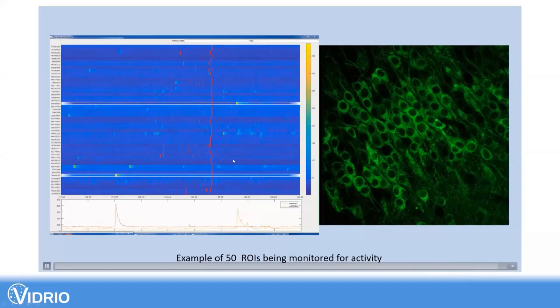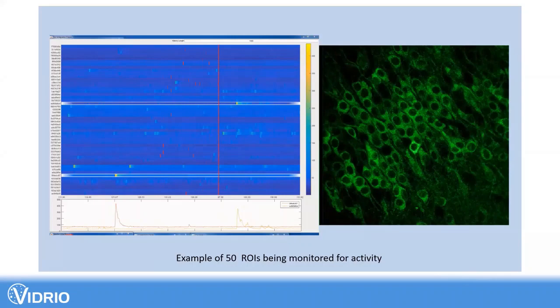So I think there's a lot of discussion about trying to do closed loop stuff. And so John's going to now demo how you would set something like this up. And it's actually not that different. You can use that region of interest type of interface, or you can define your own mask, if you have a way of segmenting the cells, or you want to load in a mask that tells you exactly where you want to monitor, et cetera.